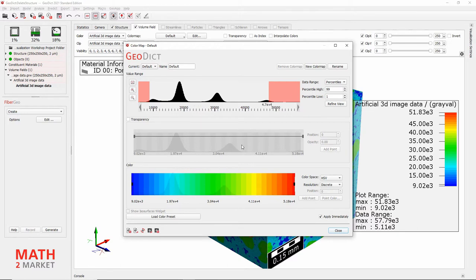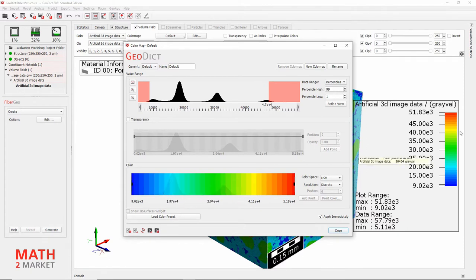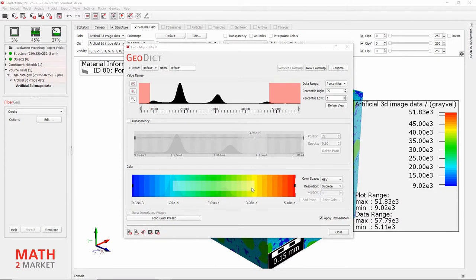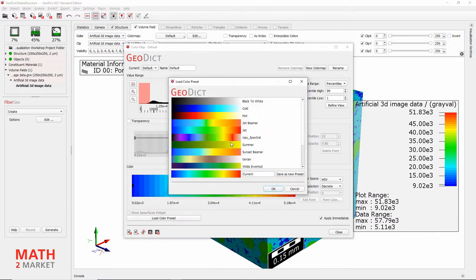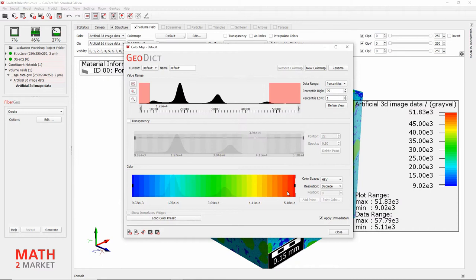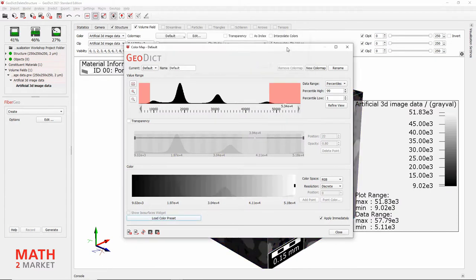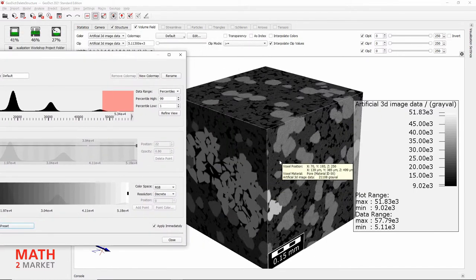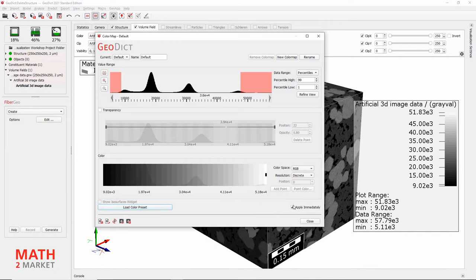In the middle you can see the transparency setting, which maps data values to a certain transparency value. Because we have disabled transparency, this has no effect and is grayed out. At the bottom we can see the mapping of data values to colors, which is reflected in the color scale next to the image. To change the color map, click Load Color Preset and select the first color map — a simple black to white color map. Because this will slow us down in the next step, we will disable the Apply Immediately feature by unchecking that box. This means any change we make will not be directly reflected in the rendering until we click Apply.